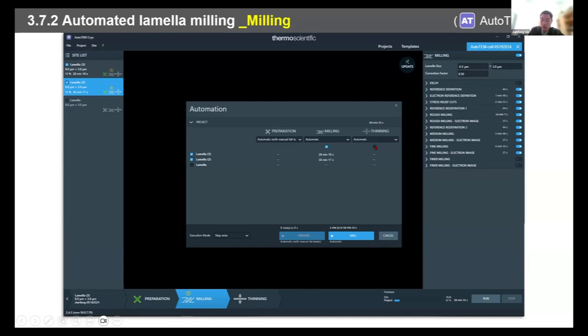And the next day, after the overnight milling, you can come back to collect your sample and transfer the sample either into the microscope or to a storage tank for further use. But if you feel uncomfortable leaving the sample in the cryo-FIB machine, especially because the current cryo-FIB machine, even though the vacuum is good, is still not good enough to avoid the ice contamination.